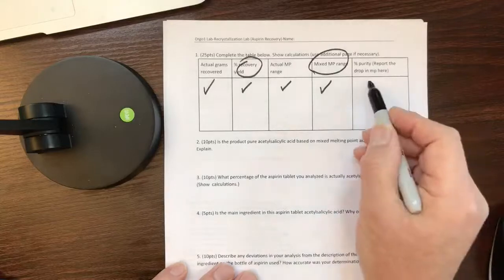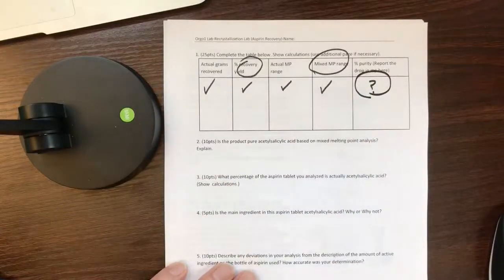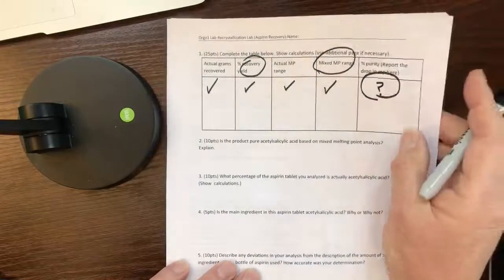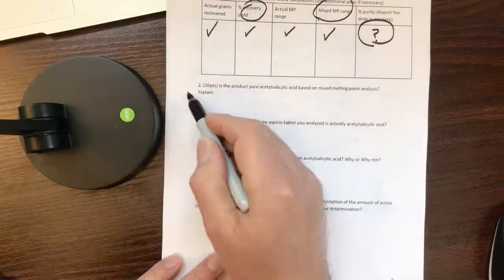Now for this part, I used to have a table that shows, if the melting point is such and such, what the percent purity of aspirin is. I couldn't find it, so I would leave it blank. We don't have an answer for that because I don't have the table. Then we have a few questions to ask you.